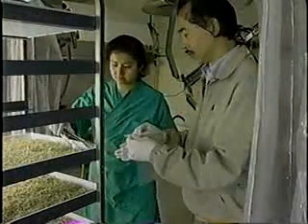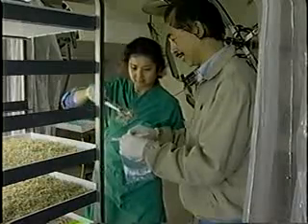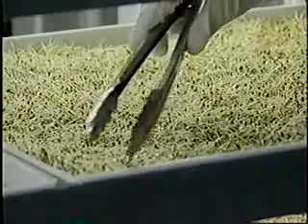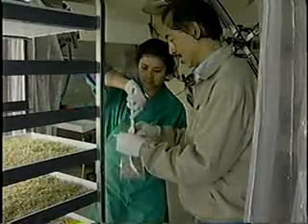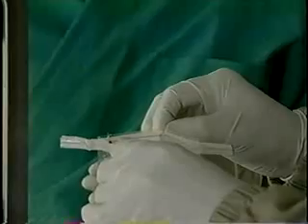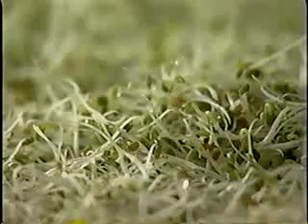If sprouts are sampled, 32 sample units should be aseptically collected, each approximately 50 grams or about 2 ounces. Sample units should be collected throughout the entire production lot, meaning from top to bottom, side to side, and front to back of the tray or drums. Each 50-gram sample unit of sprouts should be placed directly into individual, clean, sterile, pre-labeled containers to facilitate subsampling at the testing lab.